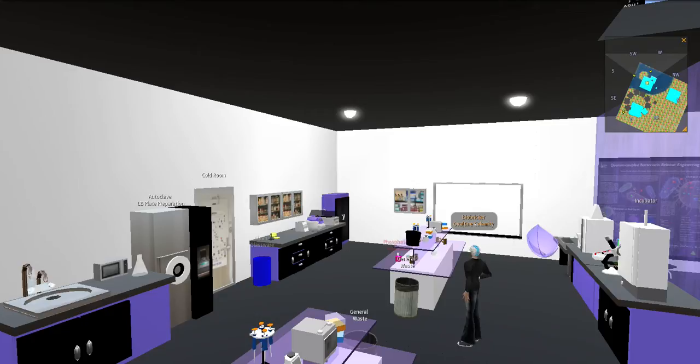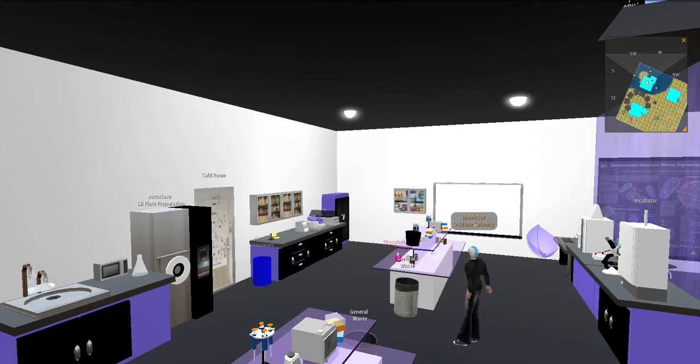Today I'm going to show you around our virtual lab, which mirrors the lab techniques we are using for our iGEM project. It also helps in reinforcing concepts that we learn in molecular biology.